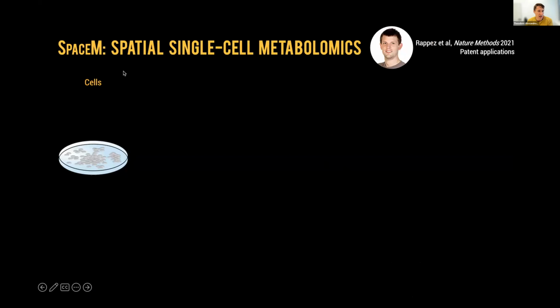called SpaceM, and this is the method for spatial single cell metabolomics. And I would like to present you this method, but first I'd like to tell a story, because when I came here to EMBL, we didn't do single cell analysis, we didn't know single cell metabolomics, but then PhD student Luca joined us, he was the first PhD student in our team, and he wanted to really develop some ambitious methods.